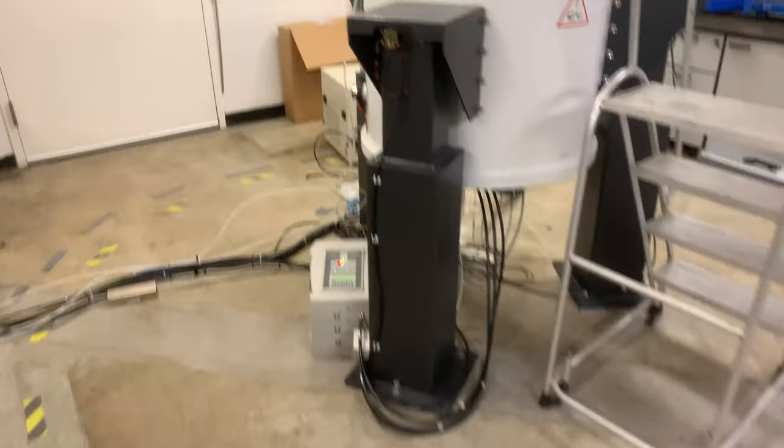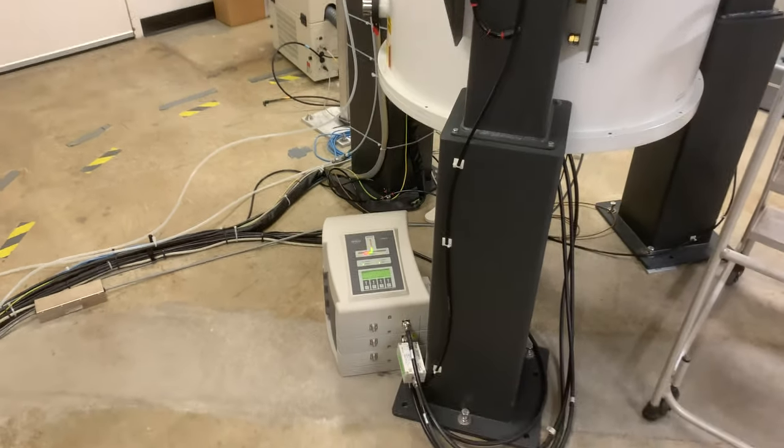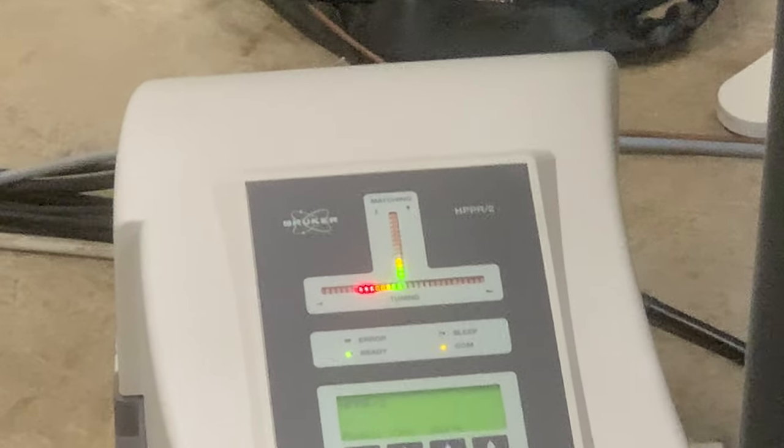So see this box, that box has a top and green line, like light, if you see. We have to make this green light, and the red light should be removed, and it can be done by changing the bottom of this NMR. There are some things, I don't know if you can see or not. I'll be changing this.